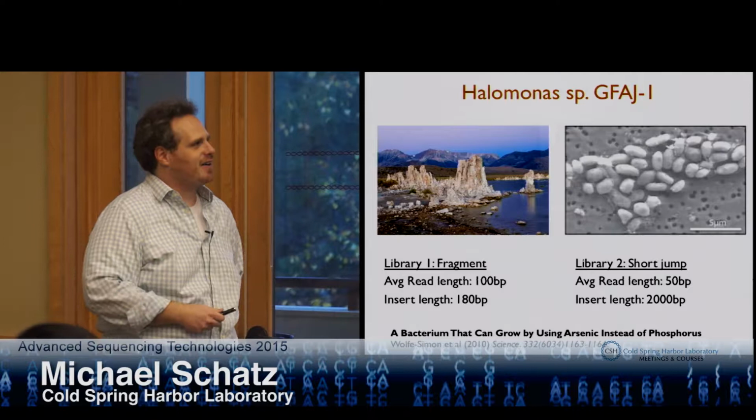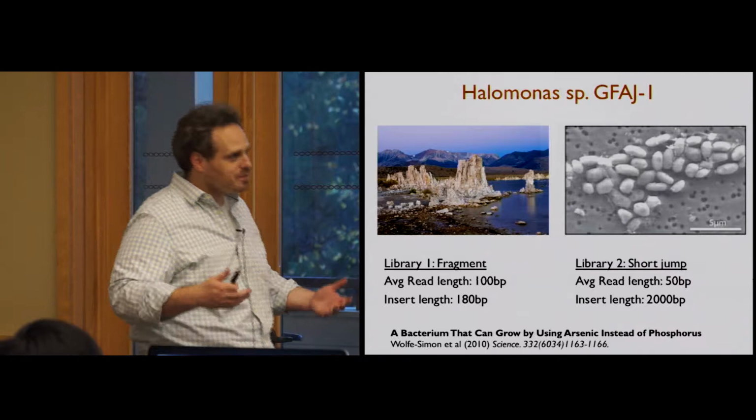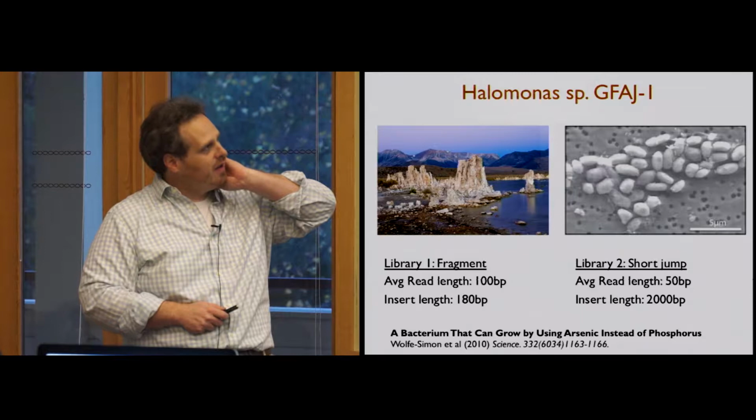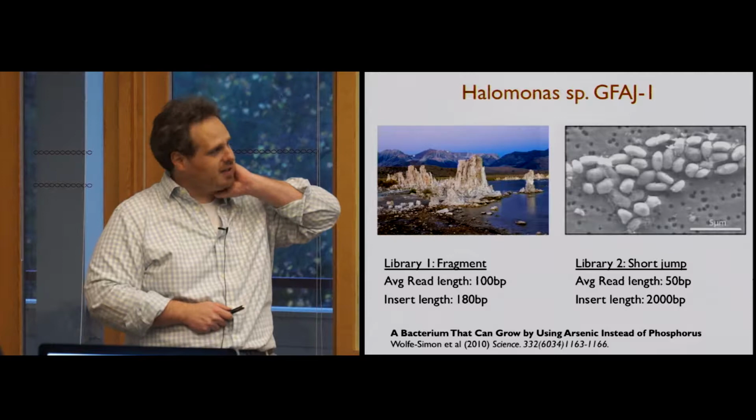This was kind of a fun project where I went to this remote environment, collected the sequences, did an assembly. What do we see here? That'll be part one of the secret message. Let's imagine we've gone to this remote environment and sequenced a microbe that looks very much like the one they thought used arsenic instead of phosphorus, but in there I've embedded a secret message that we have to decode.